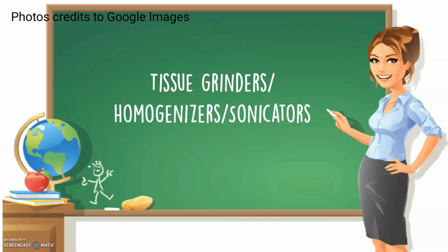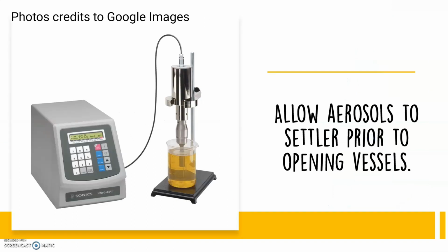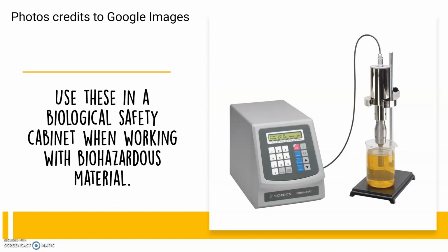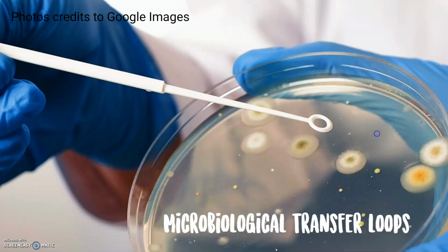However, for the tissue grinders, homogenizers, or sonicators, allow aerosols to settle prior to opening vessels. Use these in a biological safety cabinet when working with biohazardous material. Wear gloves and hearing protection.